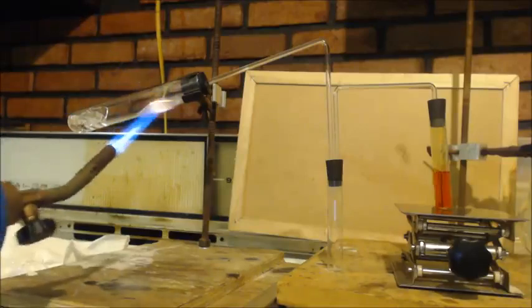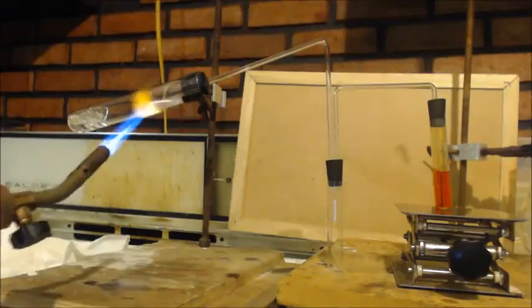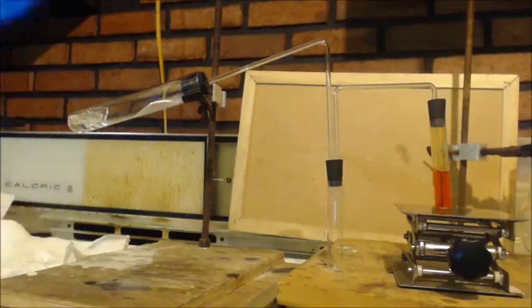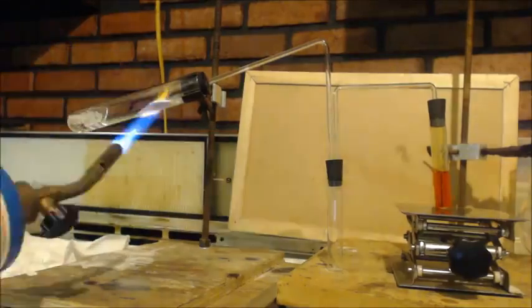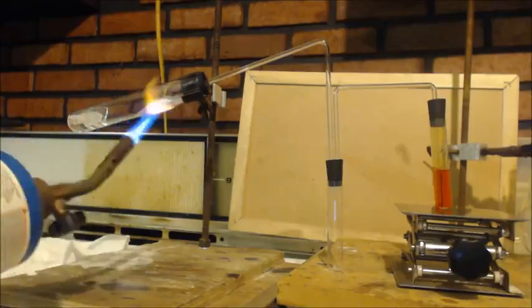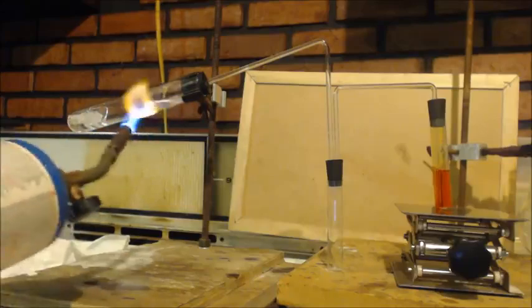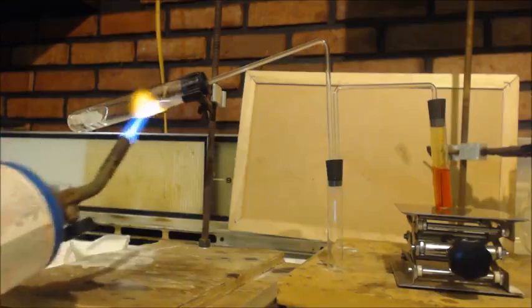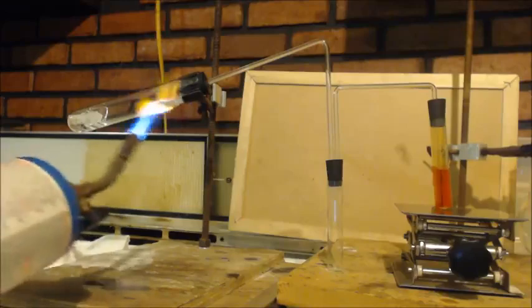Now there's an outlet on that last test tube, so it won't fill up. There's two holes, one hole for the tubing and another hole for an escape, so it doesn't build up too much pressure. Oh, there goes the bubbles finally. Jeez. Now that red should be getting lighter and lighter as I do it. Well, first I got to get rid of the air.